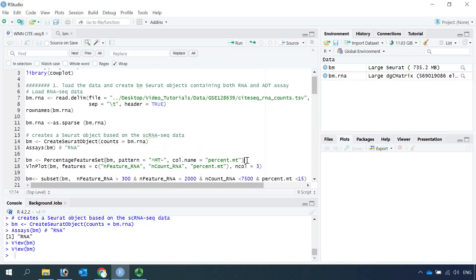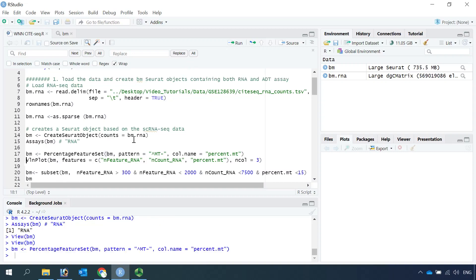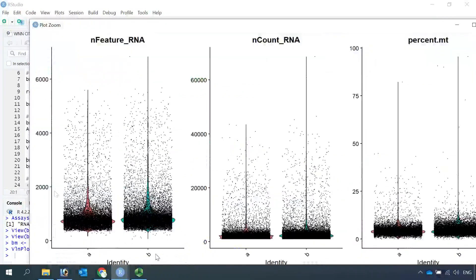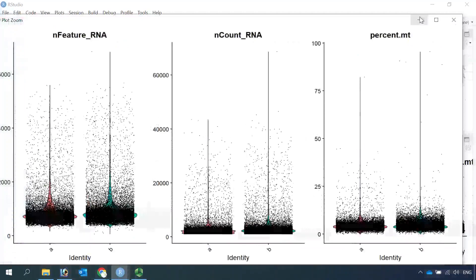First we need to calculate the percentage of mitochondrial DNA and store it in the metadata. Then we can use the violin plot to have a look at the number of features, number of counts, and the percentage of mitochondrial DNA. You can see high-quality cells have n-feature RNA below 2,000, n-count RNA below 10,000, and percentage of mitochondrial DNA below 15%.